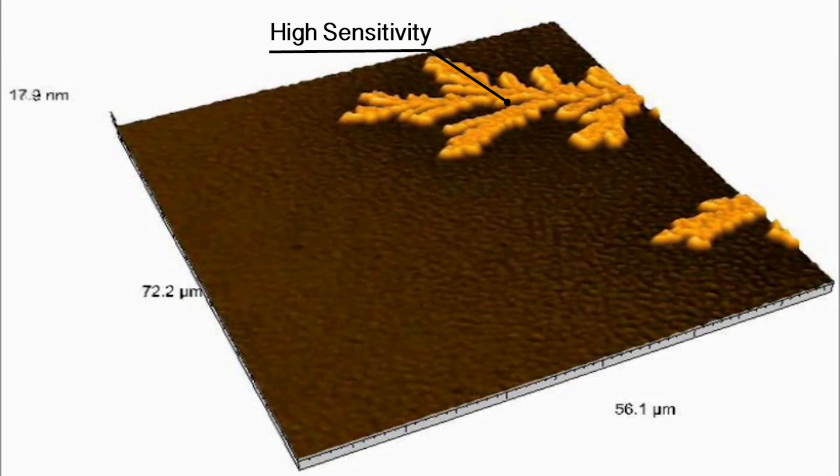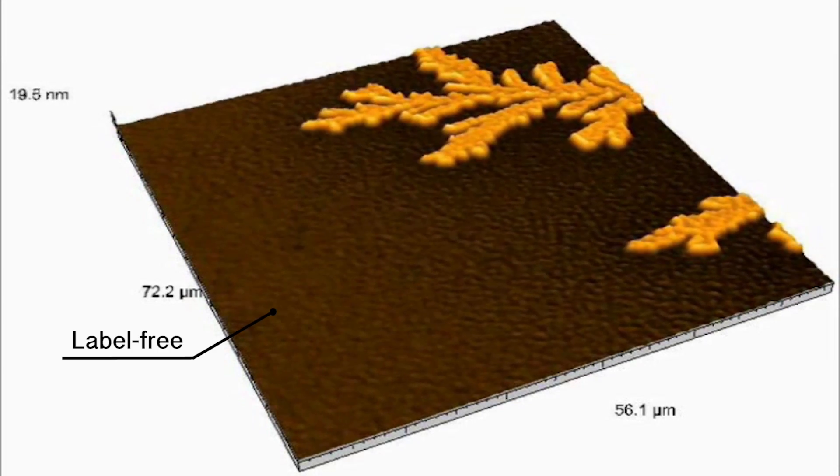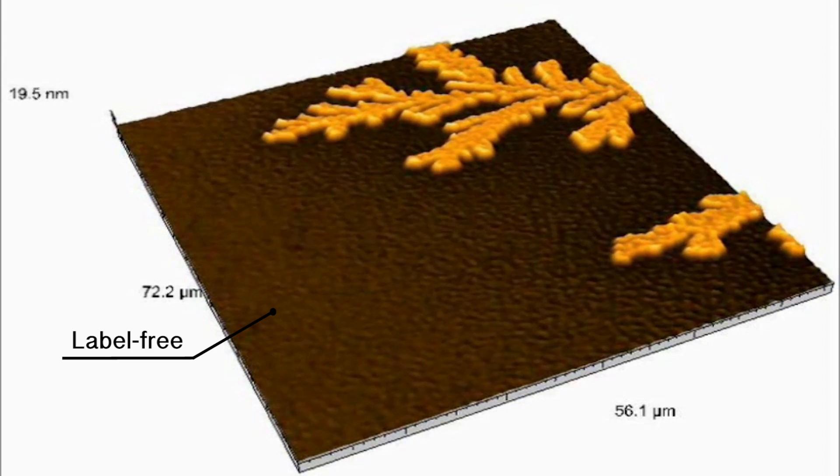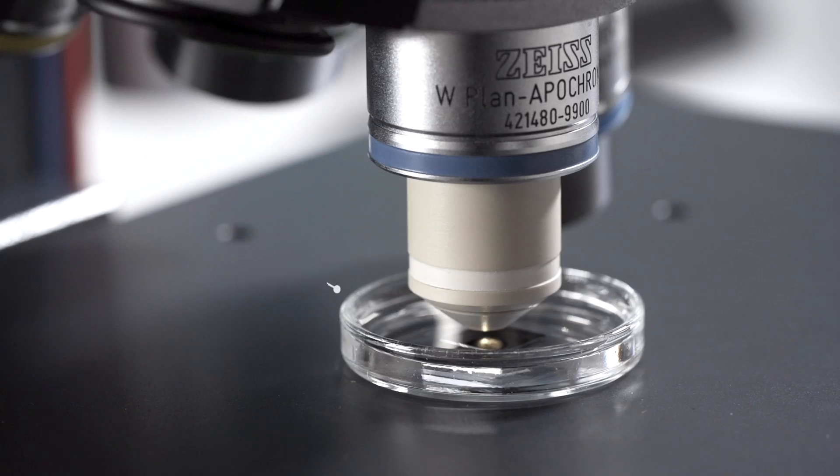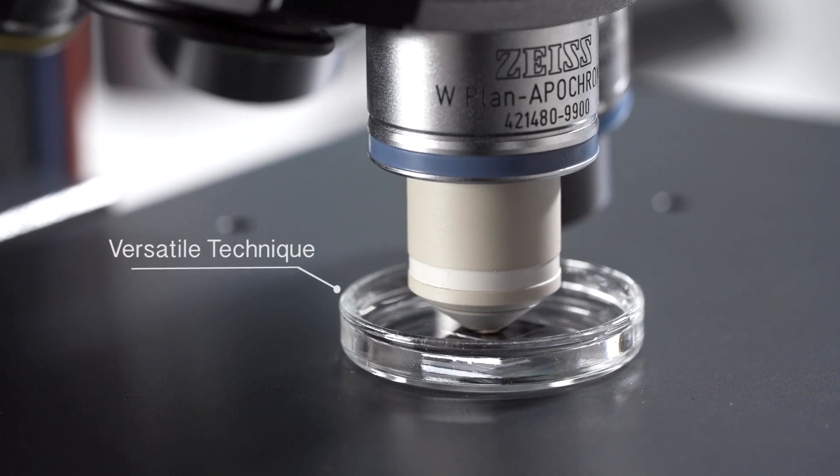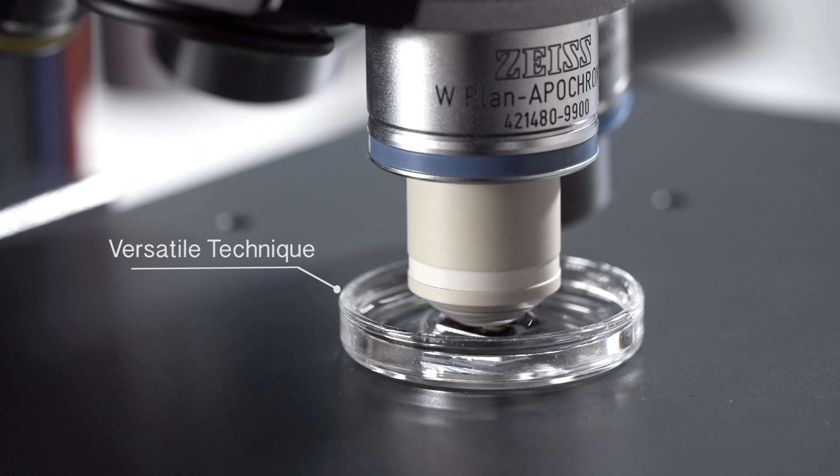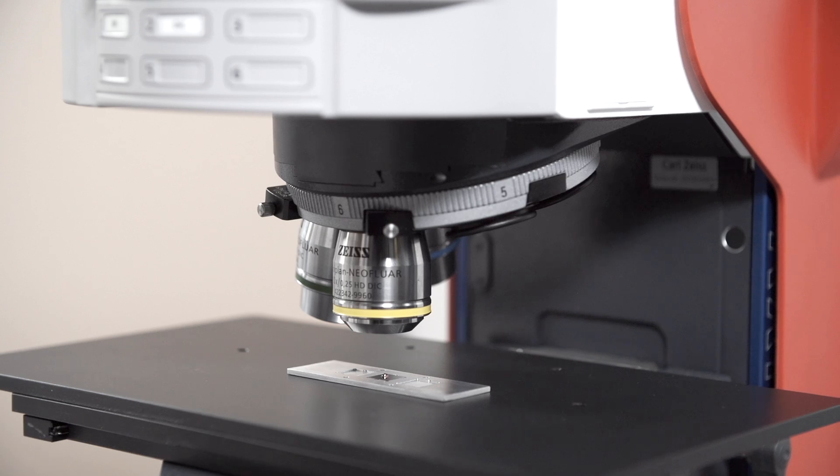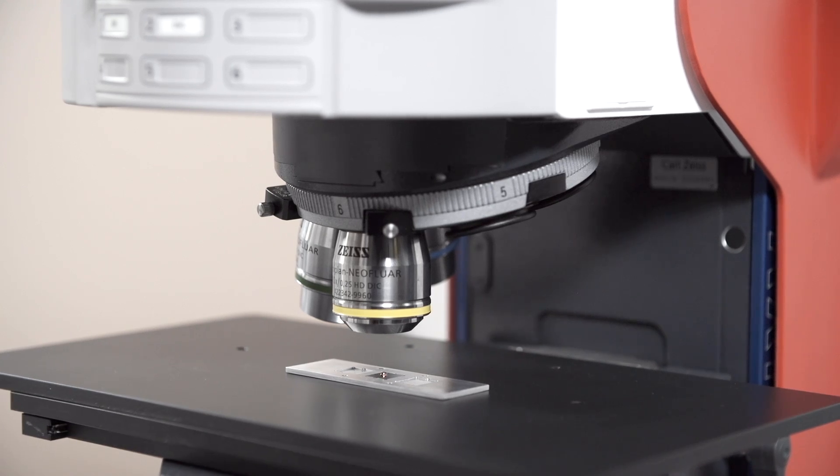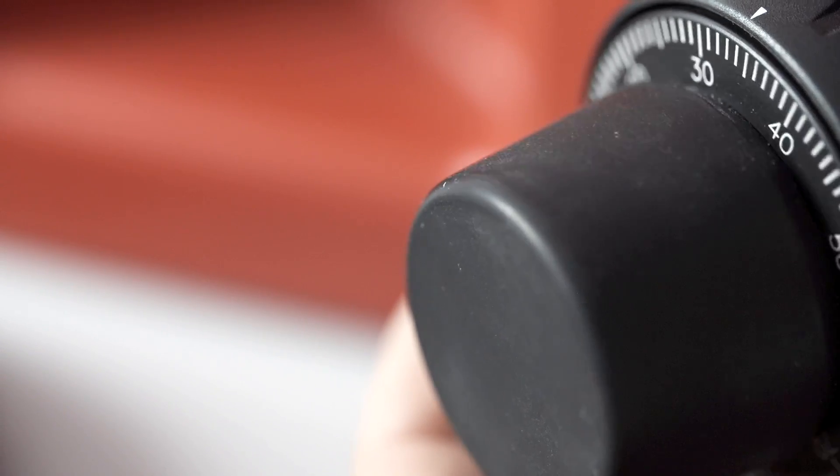Visualize directly your samples without labeling. Analysis can be carried out in air and liquids at different conditions of pH, concentrations, and temperatures.